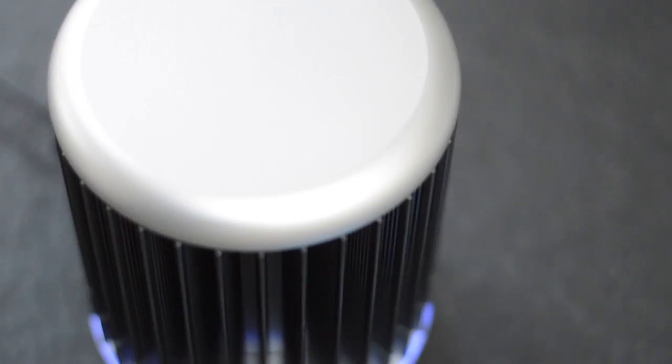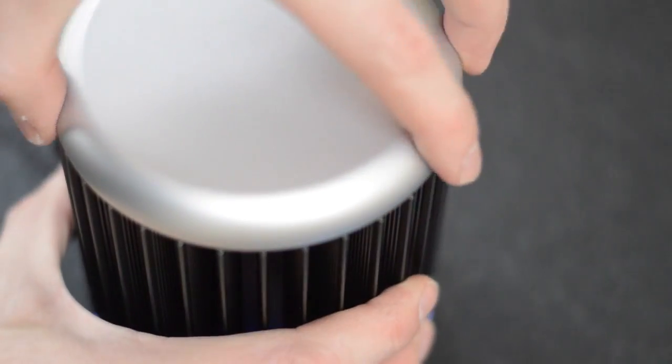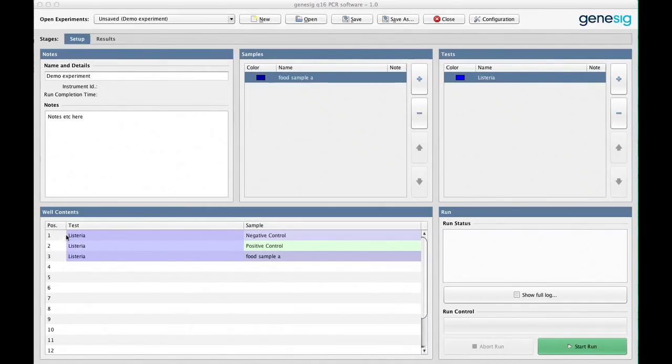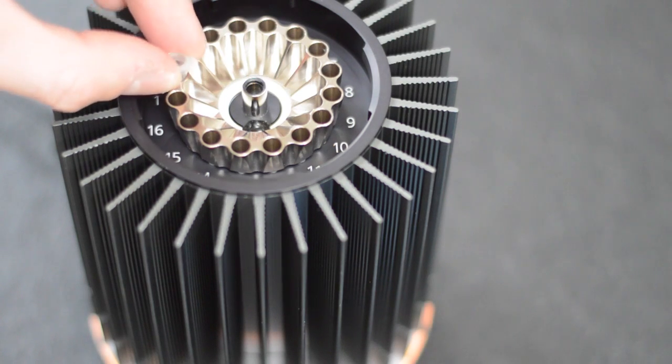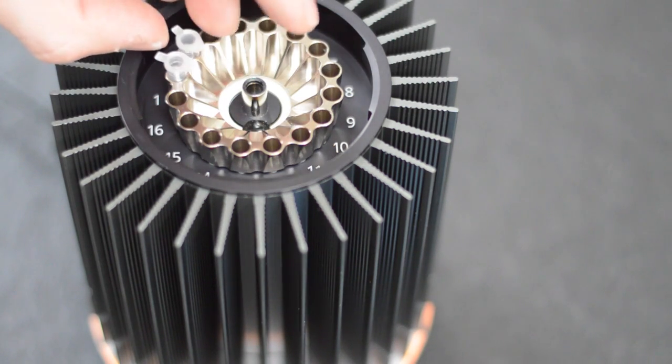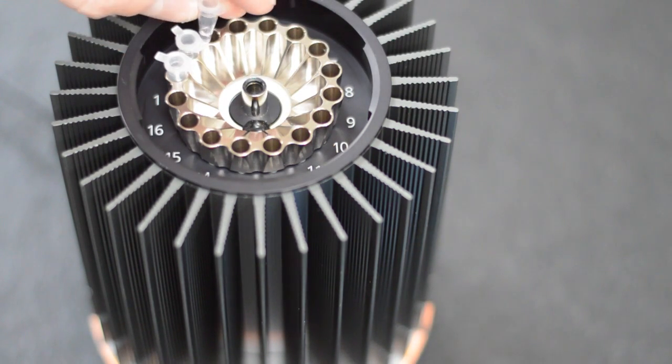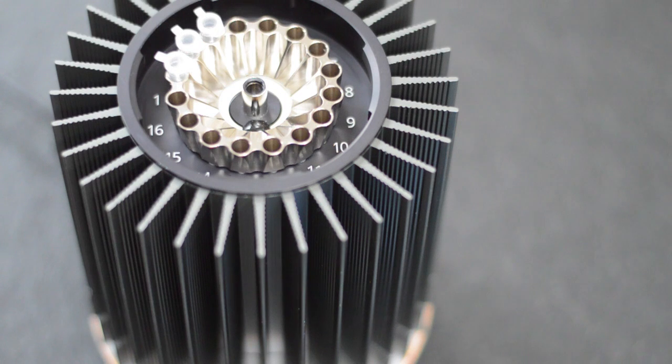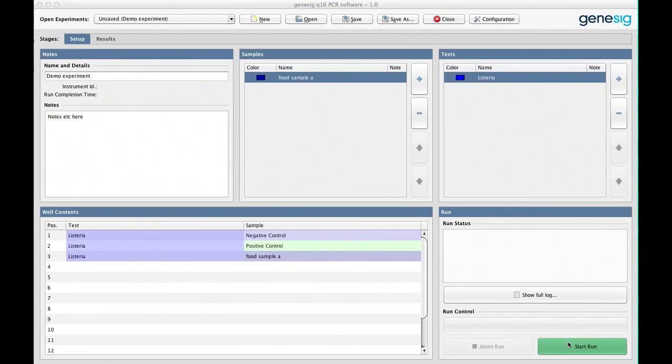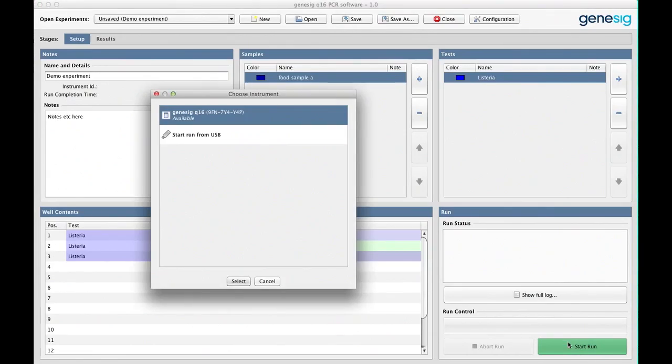Now place those tubes into the correct positions in the Q16 as defined by the software. Close the lid and click the start button.